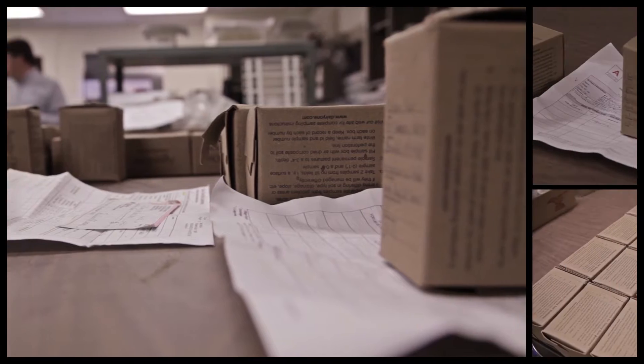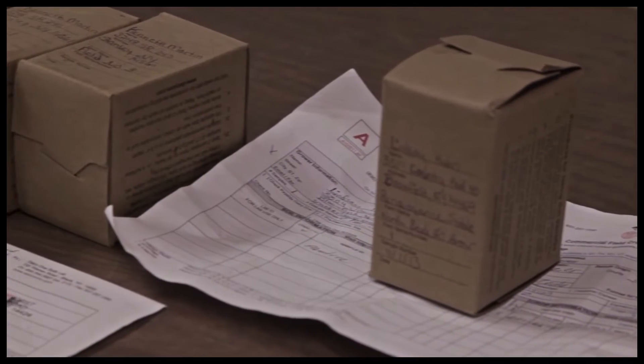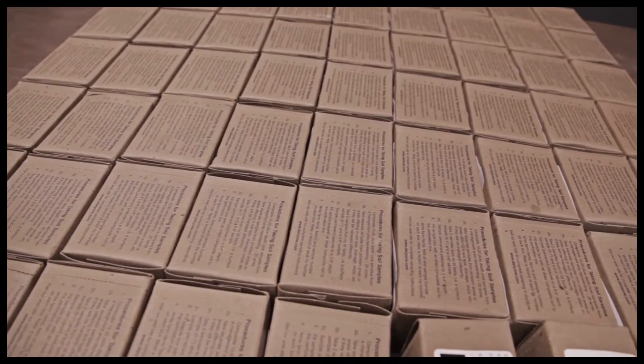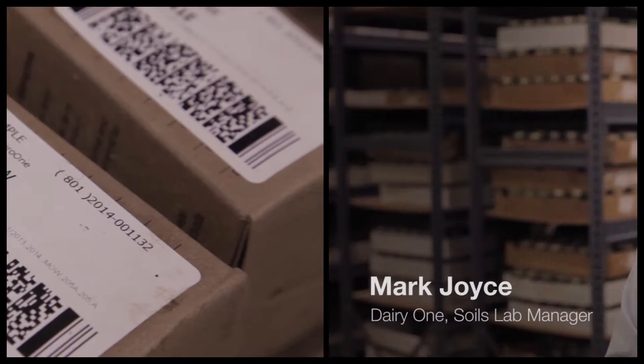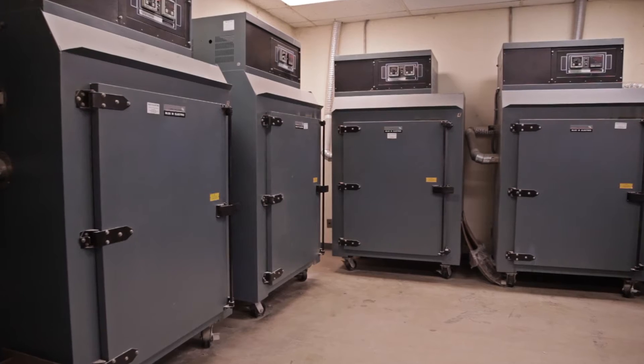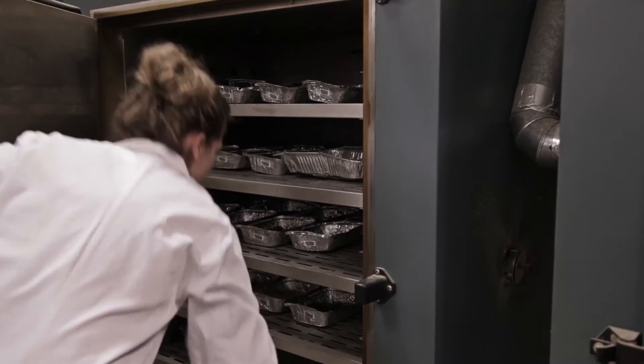When soil samples come in, they come in a variety of ways. They may come in a bag or in a box. We generally prefer boxes. We sign them in and put them in racks of 35 samples into a drying oven for two days.